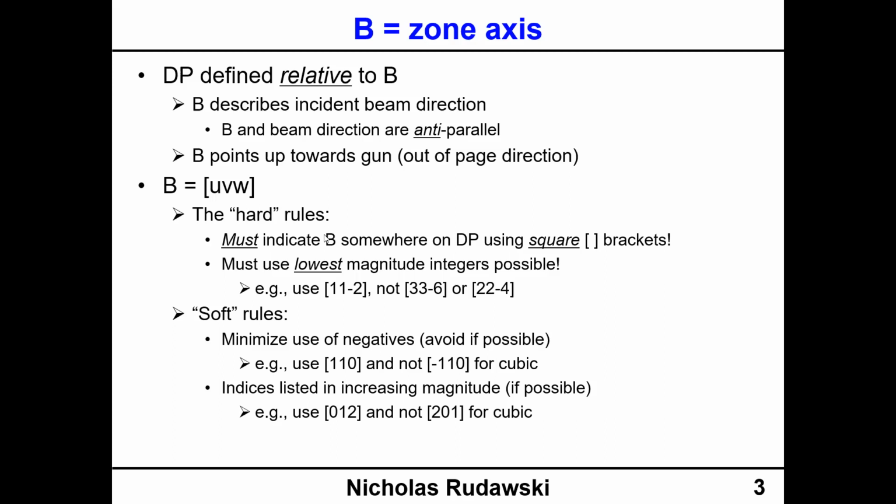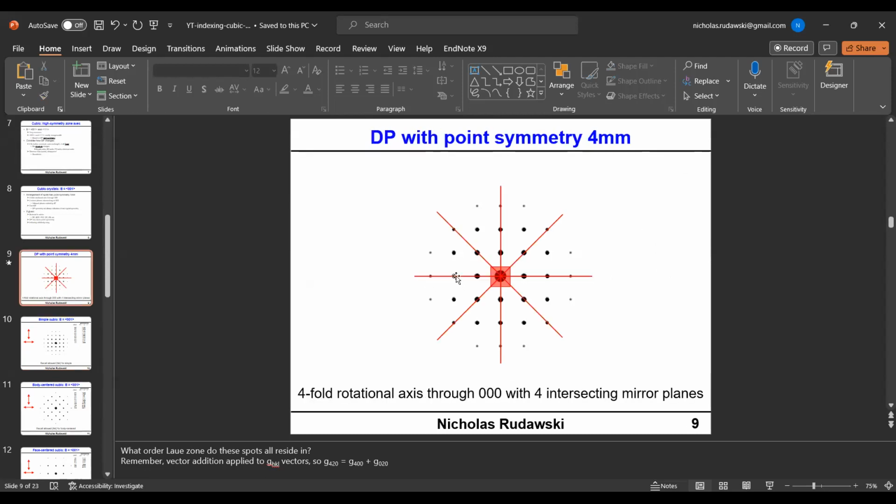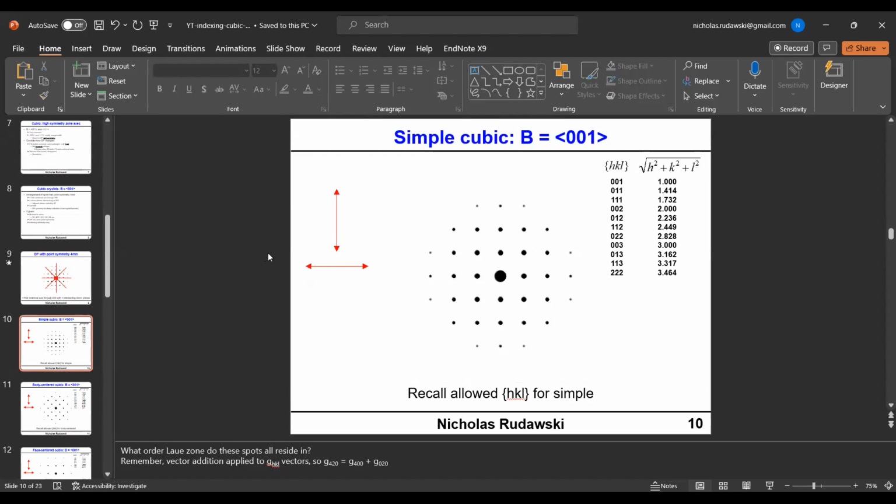So now we have to figure out what the spots are. If you want to be careful, you should actually go and measure these and verify, even though it looks like these are equidistant. You should actually be measuring and making sure that you have that. So let's go ahead and do this here for the sake of it. Okay, there we go. Swap back. All right, so let me go, where are we?